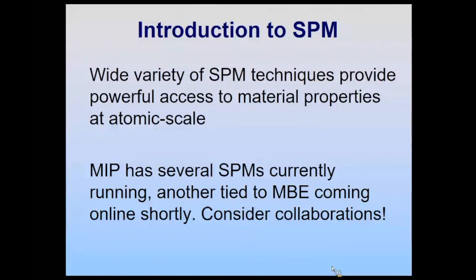So we have one more online. This has to do with the SPM. They want to know, can the SPM be connected directly to the MBE and used when it's running, so in situ? That is the plan. Check back in a few months and see if the answer is yes.